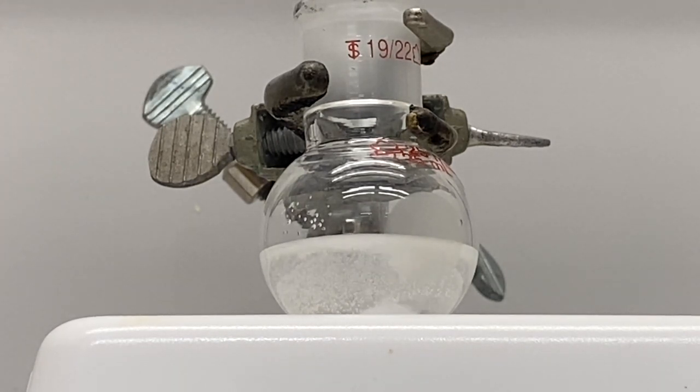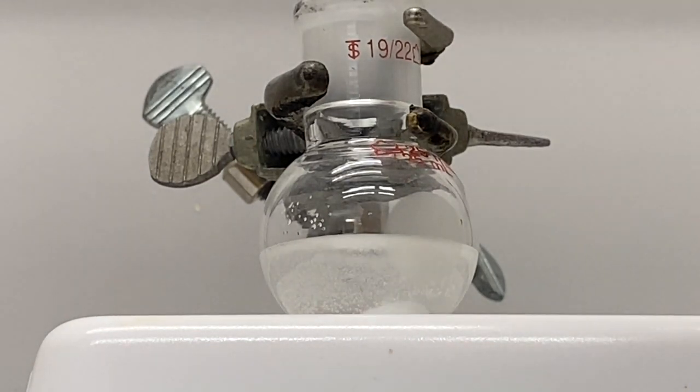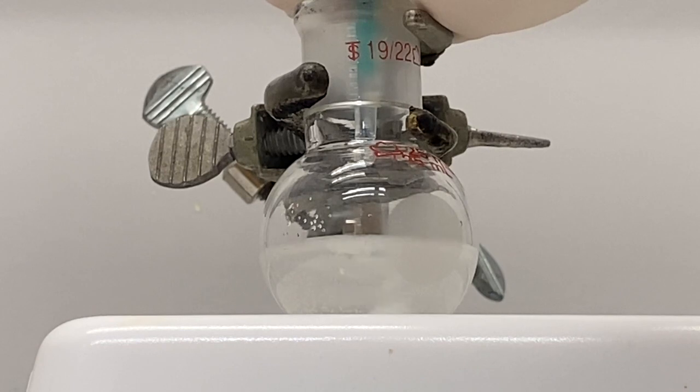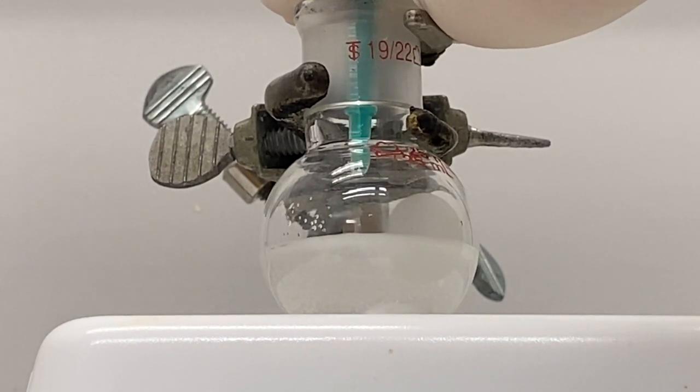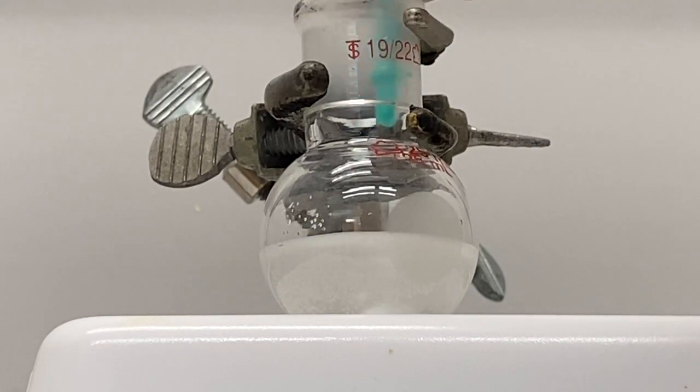So as you can see, most of our solid has dissolved. So now we're just going to add our aldehyde. Here's where you're going to have to figure out how much I'm adding. I'm going to add the aldehyde and then this is going to stir for a bit, and we'll check it with TLC to see if it's finished here in a little while.